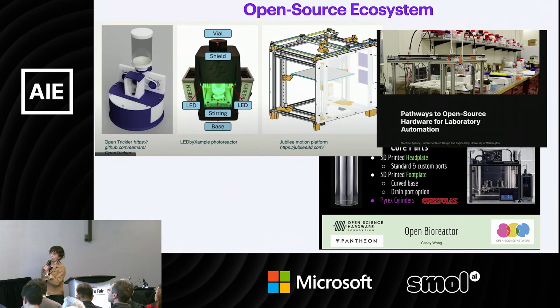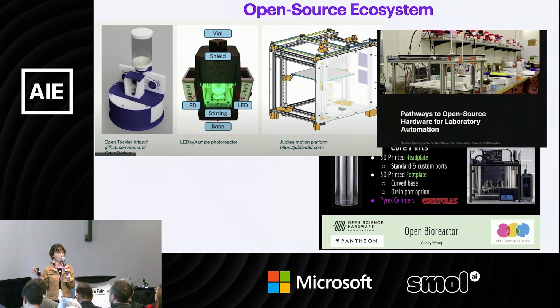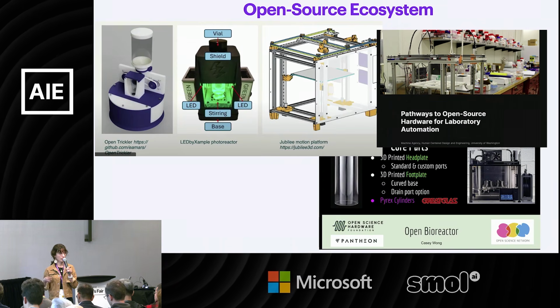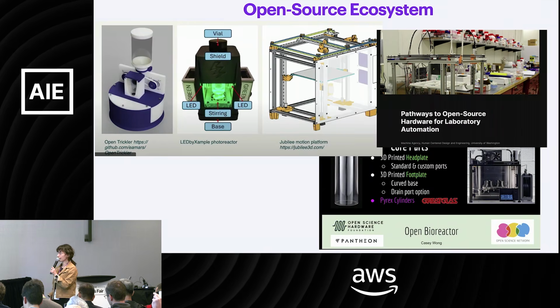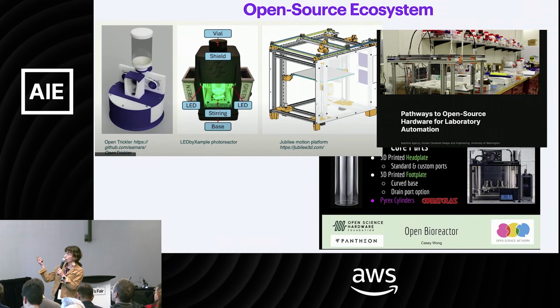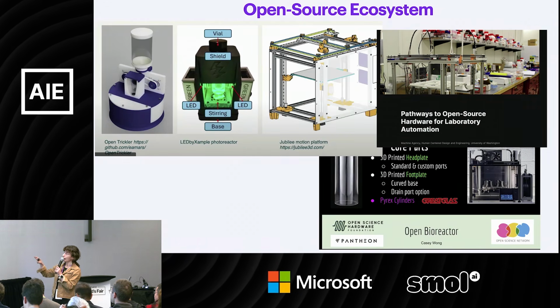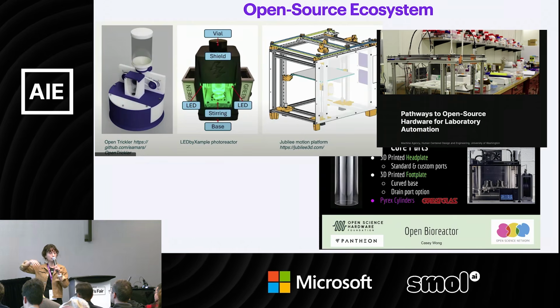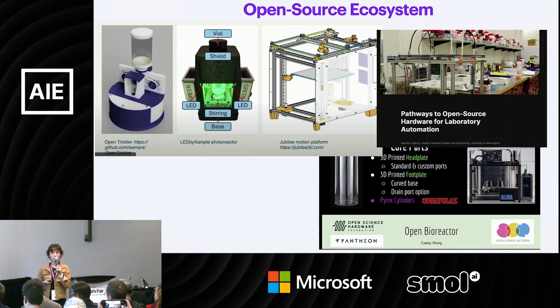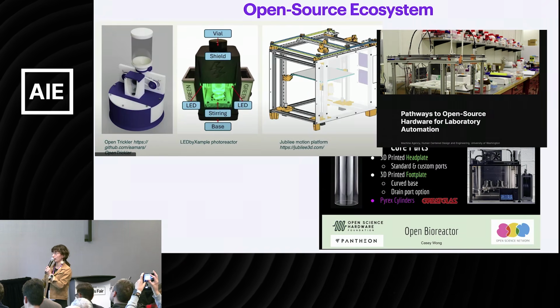And I wanted to end by talking a little bit about the open source ecosystem that can support this type of initiative to go beyond the demo and cool experimentation to a real solution for scientists and builders. So there's an entire open source ecosystem for recreating all the lab equipment, but also for creating machines that can support the automation of pipetting and all the analysis and manipulation that you need to do in a lab.